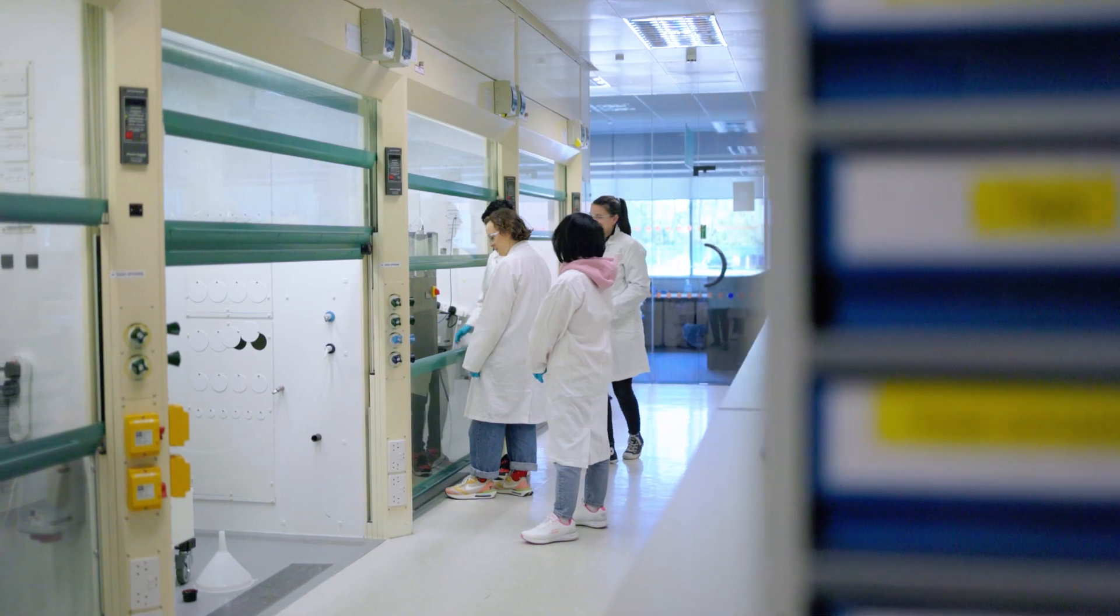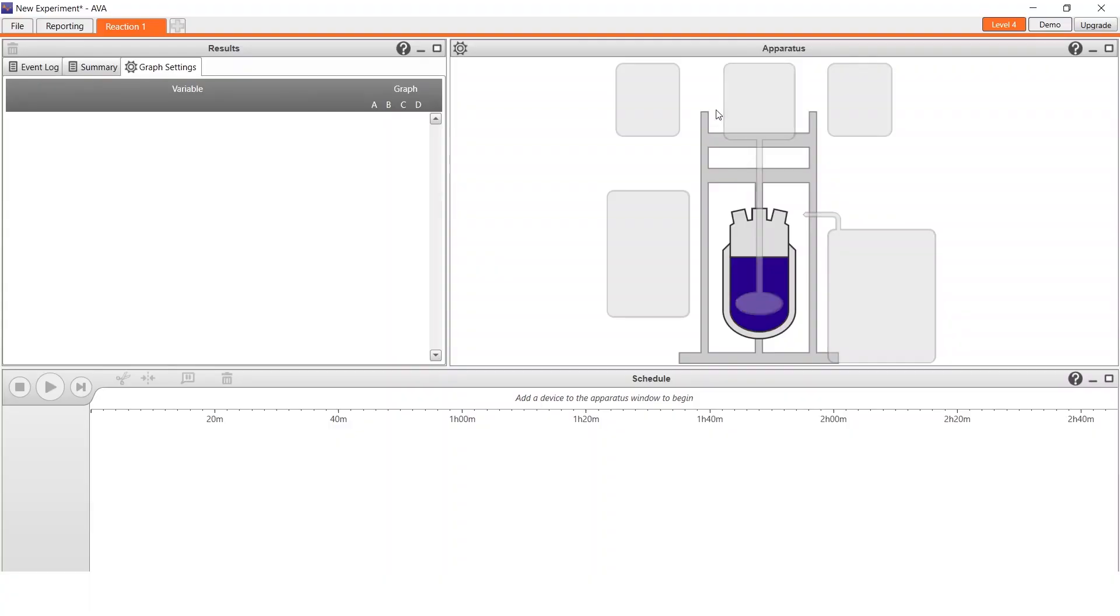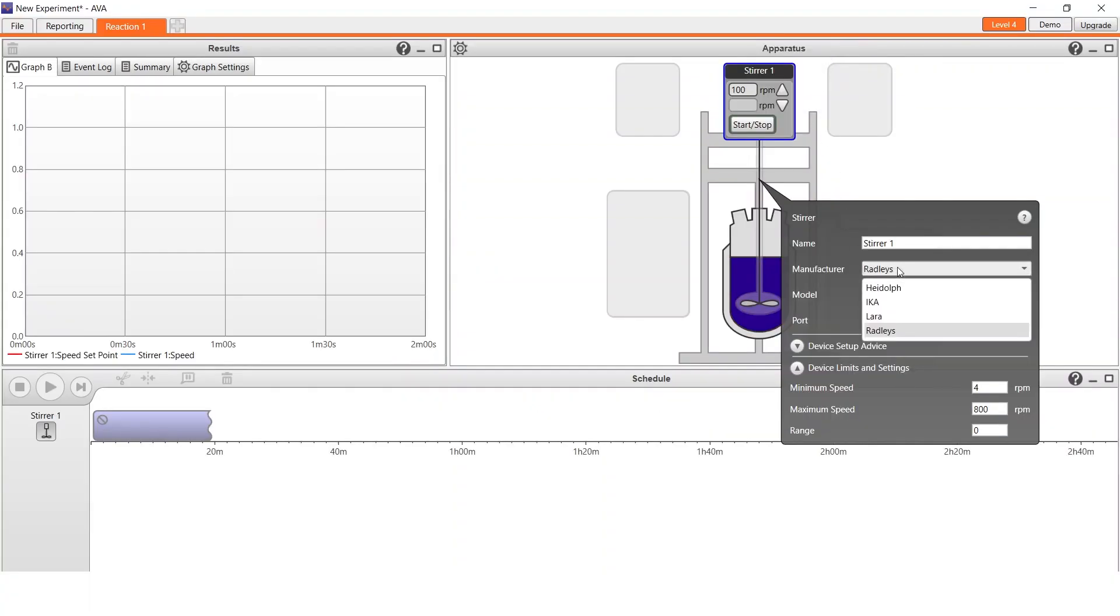My name is Paul Shaw. I'm a senior research chemist here at Chambour Molecular. I lead projects anywhere from route scouting, route development, all the way up to scale-up and manufacturing. In the lab we have two 20 liter fixed vessels and a double-jacketed 10 liter. We also use a LARA as well. These are all operated by the Ava software.